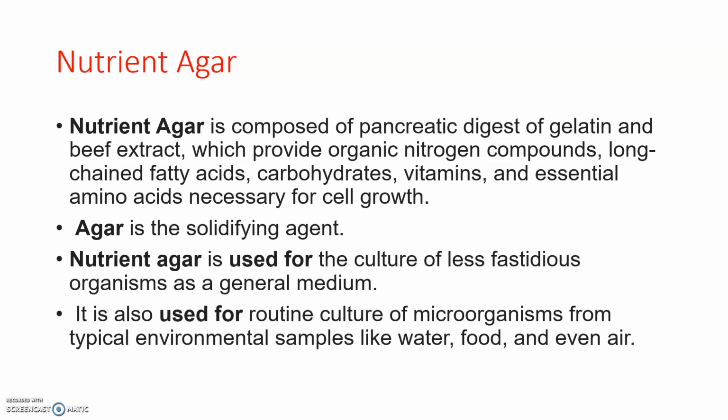In nutrient agar, the less fastidious organisms are those which don't require special needs. Such types of bacteria are commonly grown. It is also used for the routine culture of microorganisms from typical environmental samples such as water, food and even air.